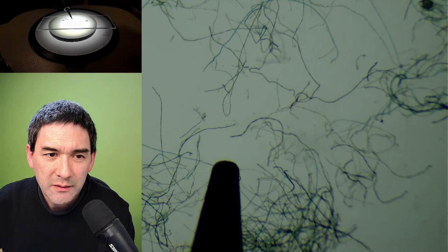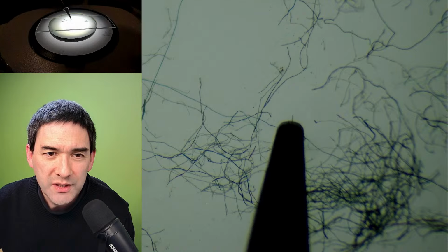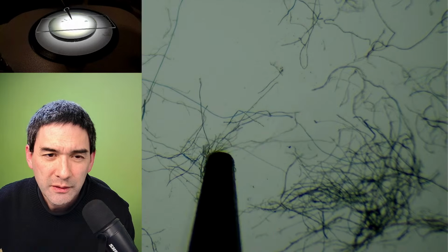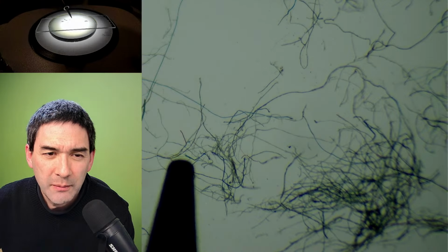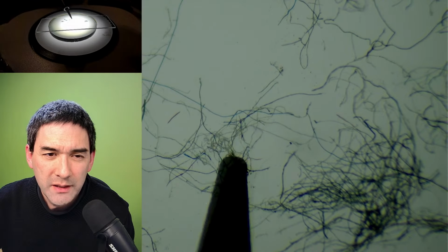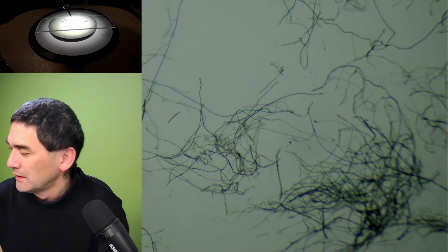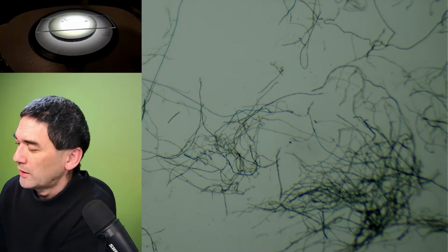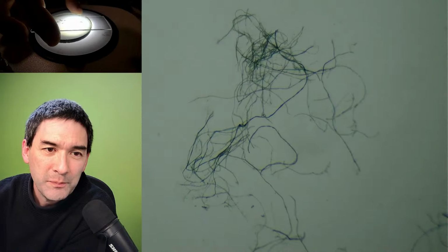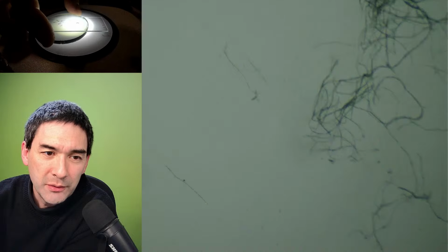This long one, for example, does not seem to respond so much. Most of them don't seem to melt, but some of them in here might. Then they pull together, and then everything sticks together. This is actually more a method problem that I'm having right now. It should be a little bit more separated so that I'm able to pick them out individually.